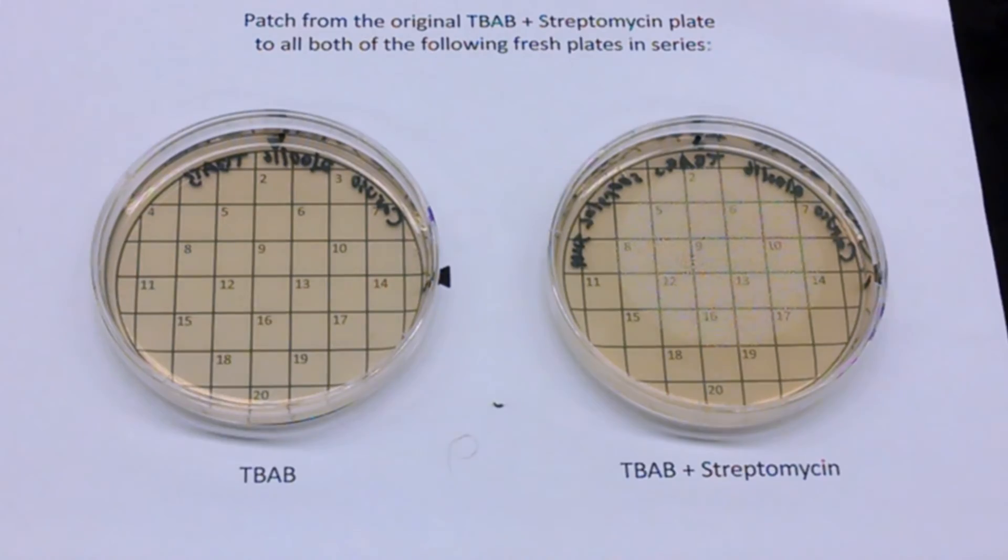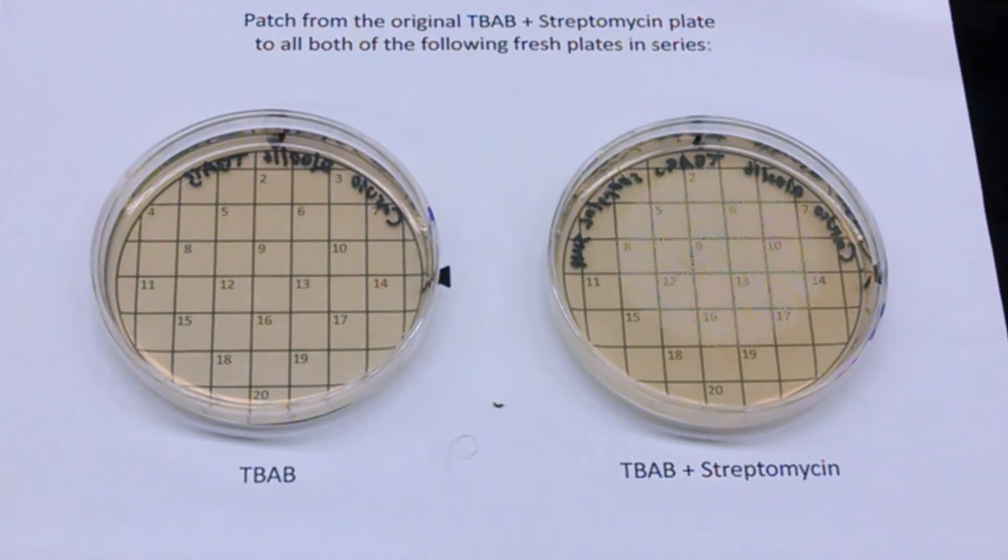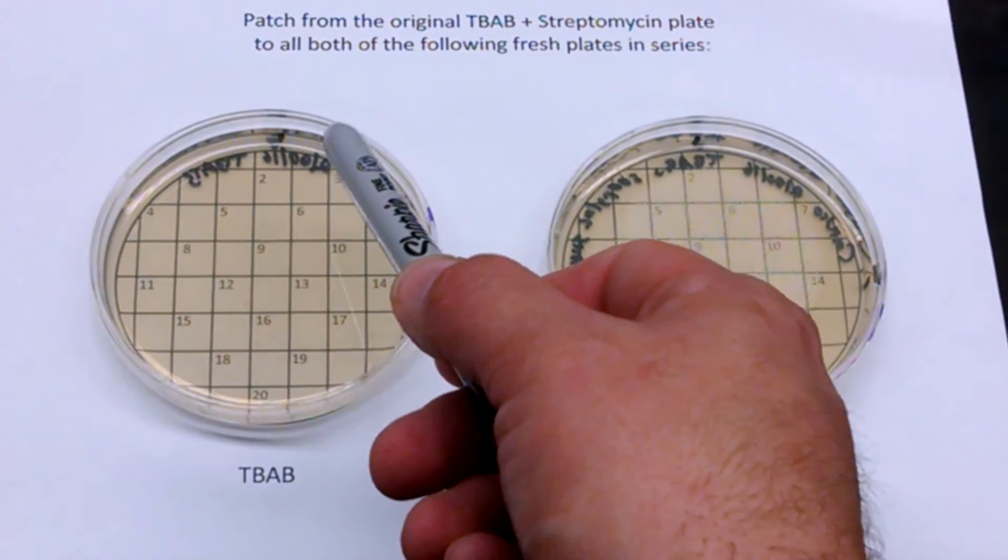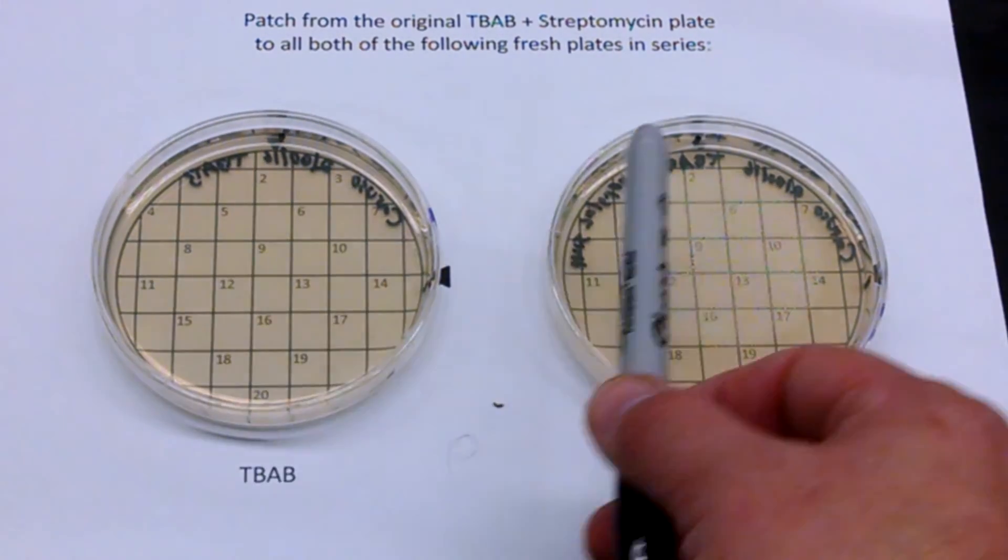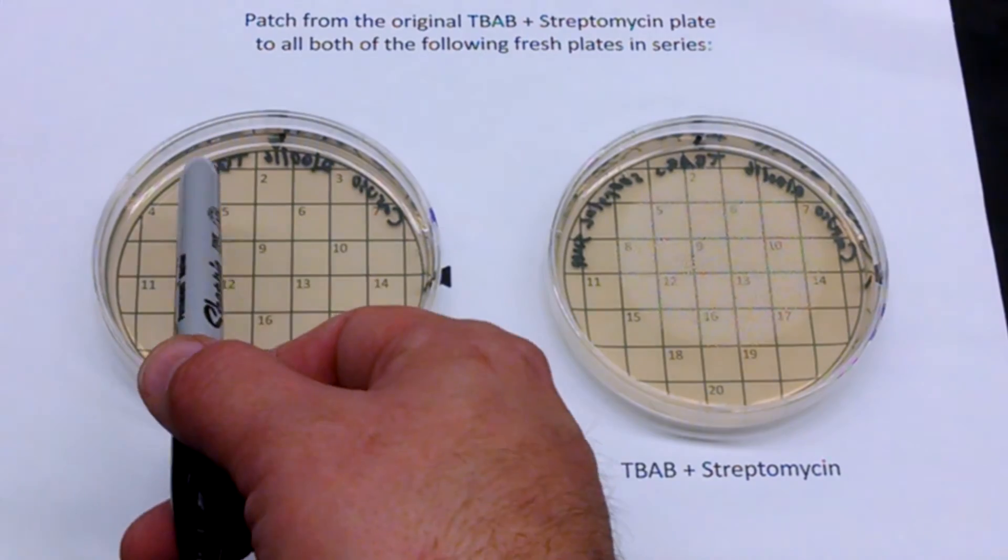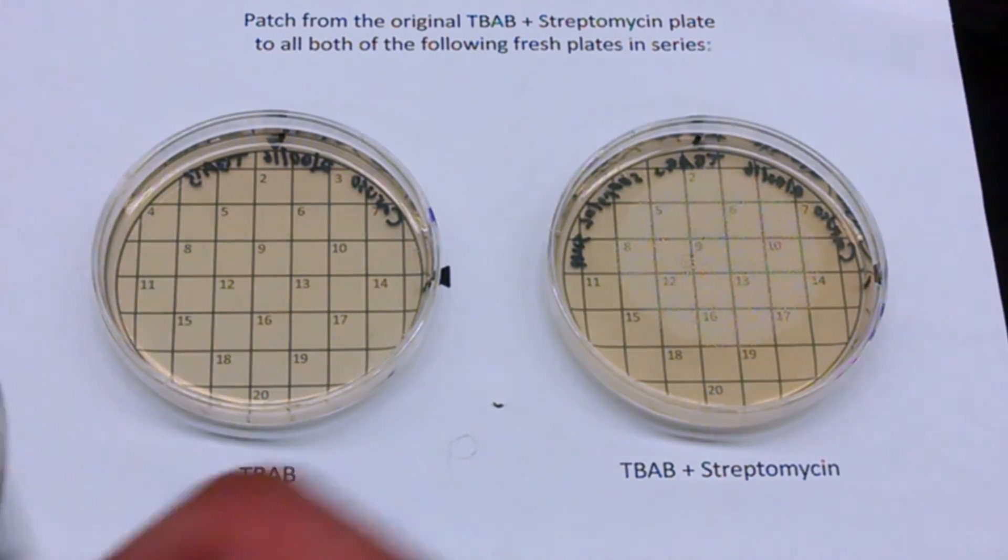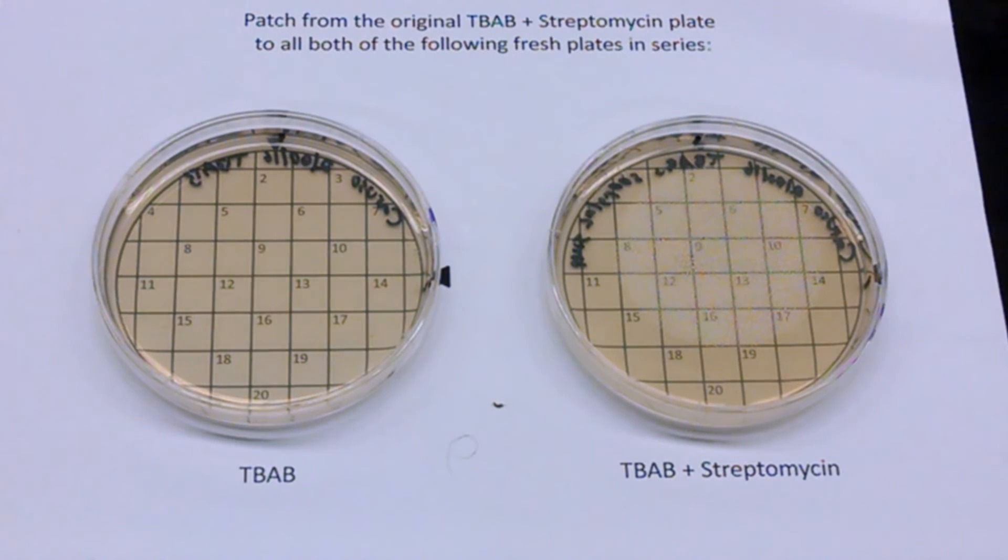And a line in the same place. And then you go back and you go to the next colony, and you draw a line in number two. And the next colony in the line in number three, and so on and so on. If you only have two colonies, instead of using the grid, you could just draw a line and have number one, number two. If you have four, you could draw a square and have one, two, three, four. But if you have more than two or three or four, the grid is very helpful for keeping track of them.